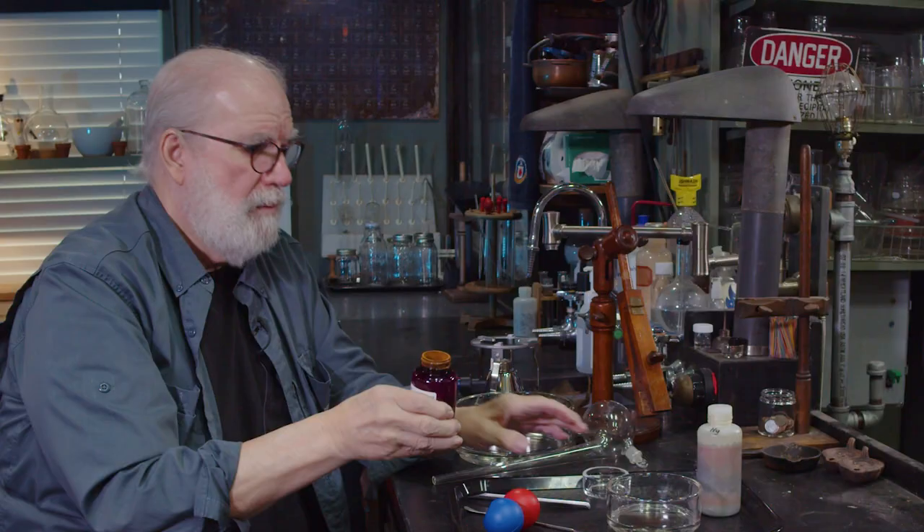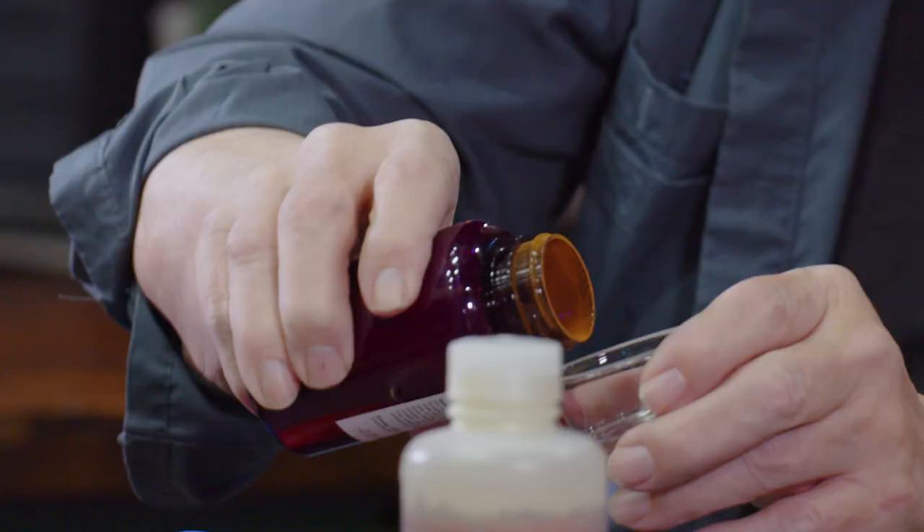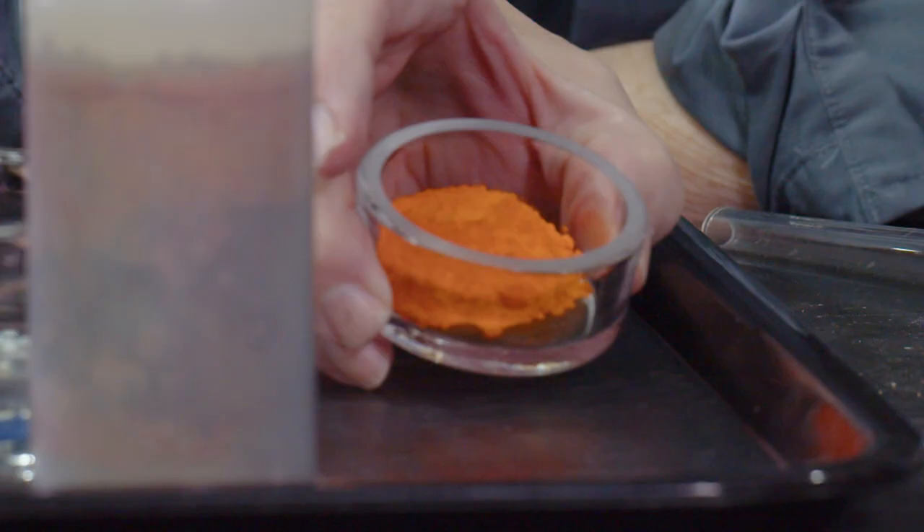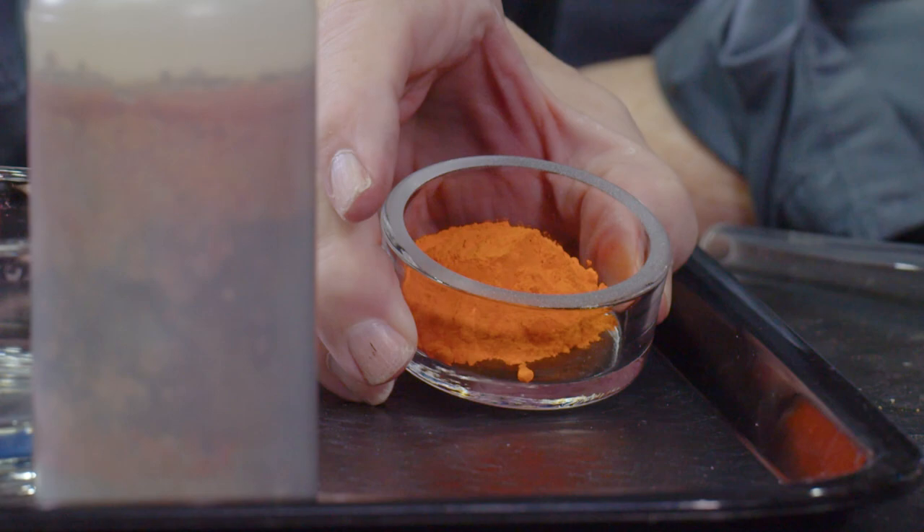That's kind of disappointing. I'm not supposed to breathe this, so I've got the fume hood up here — air going out. I'm going to take some of this and pour it in this little dish so you can see it all, see what mercury oxide looks like. That's a pretty color. This is composed of mercury and oxygen.